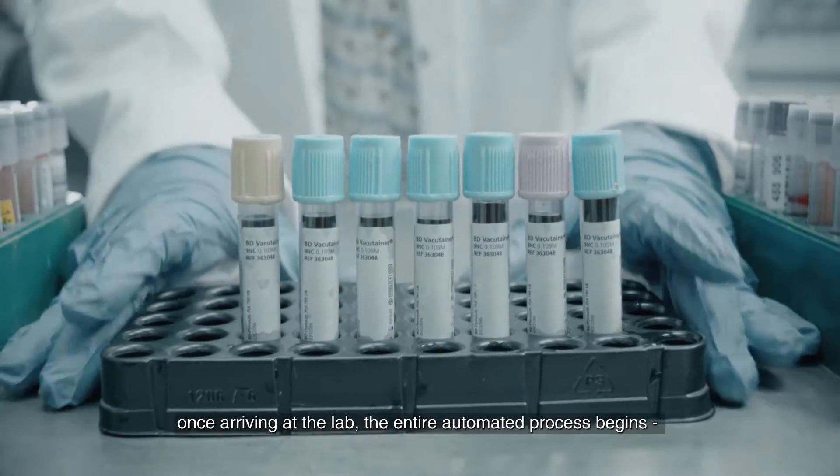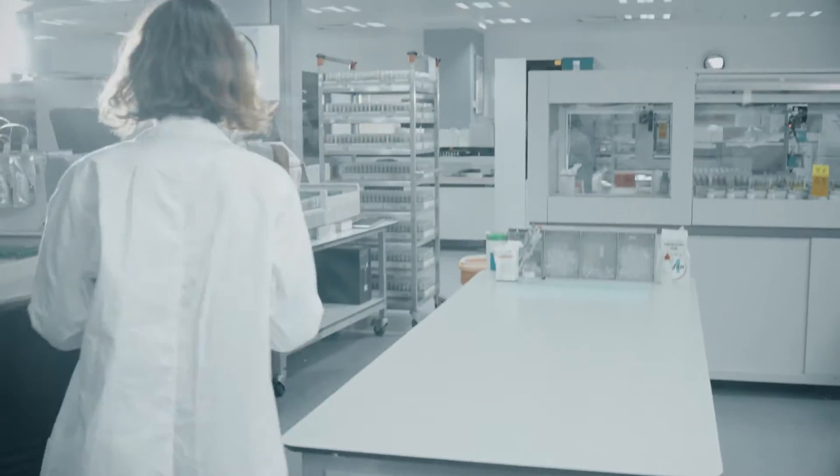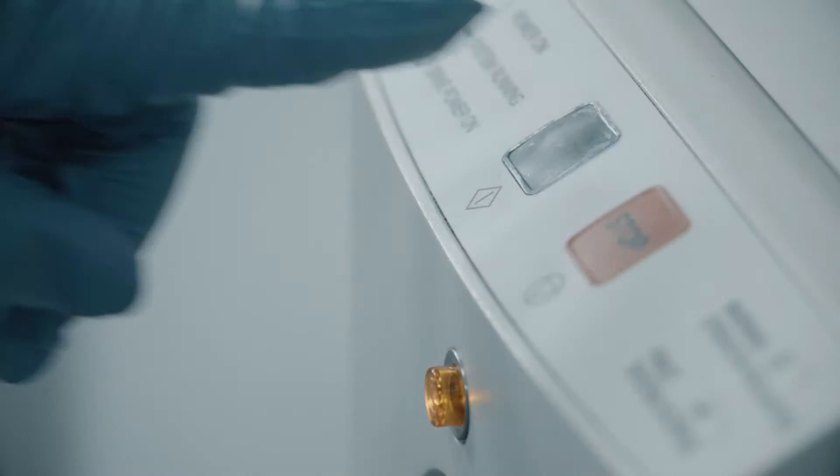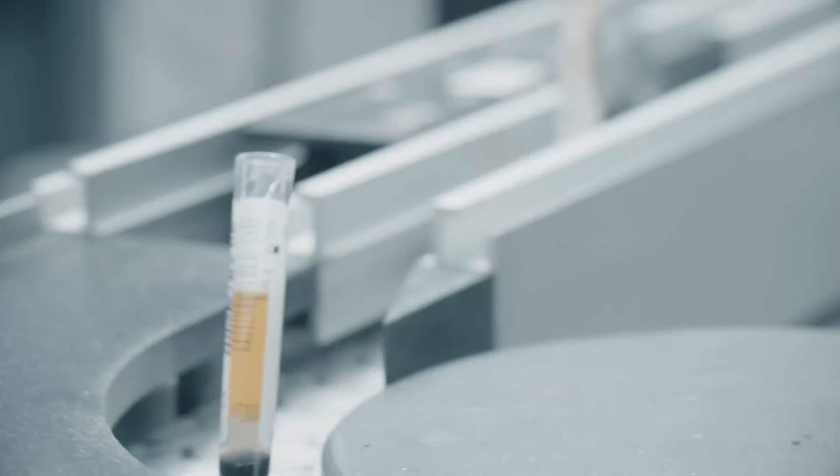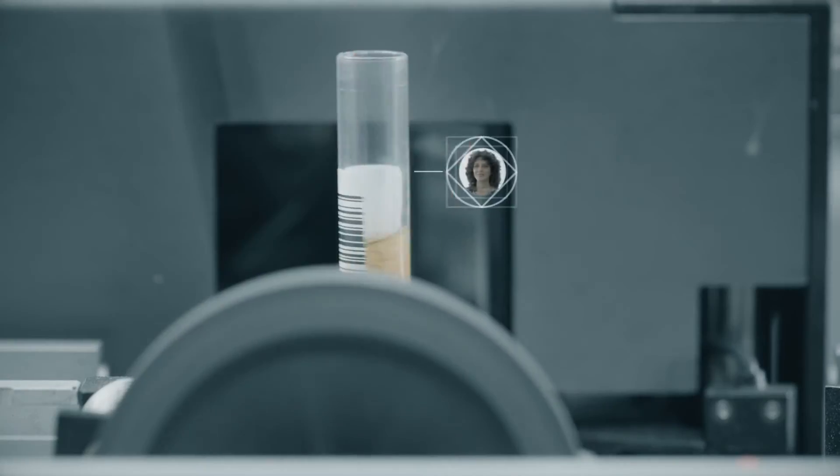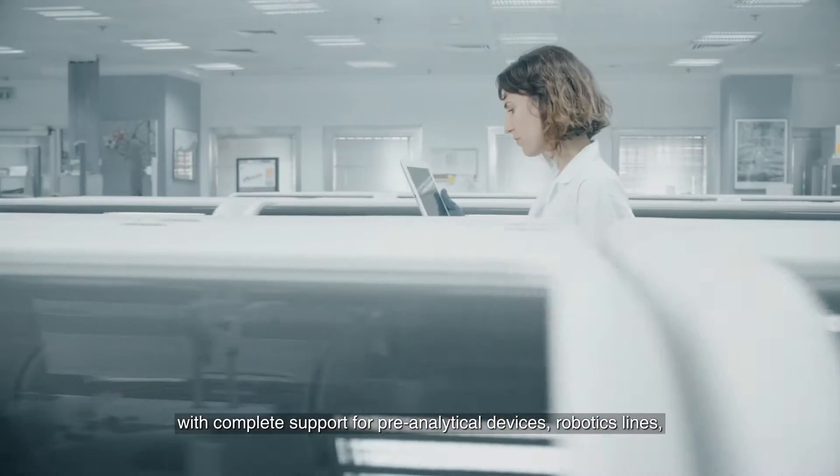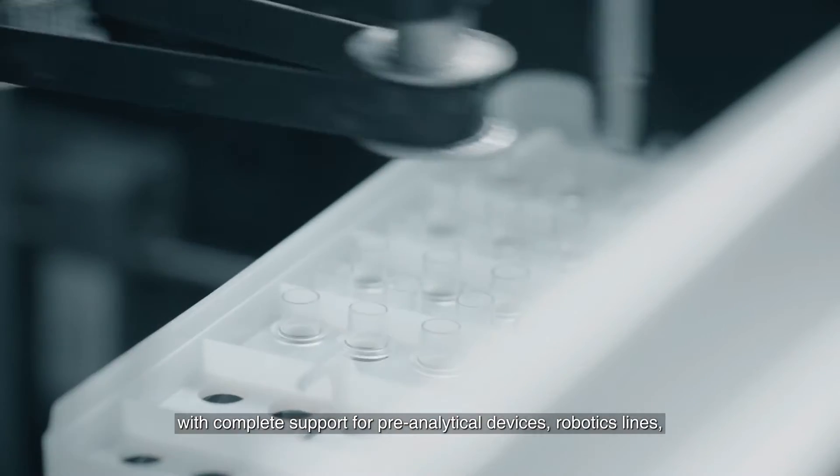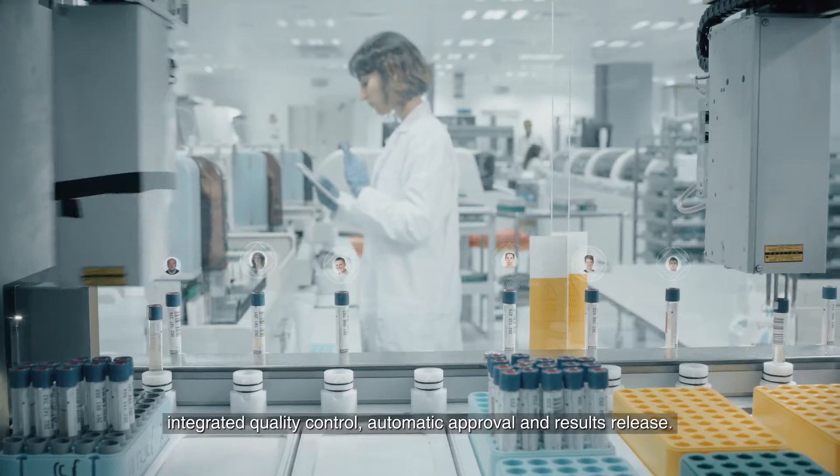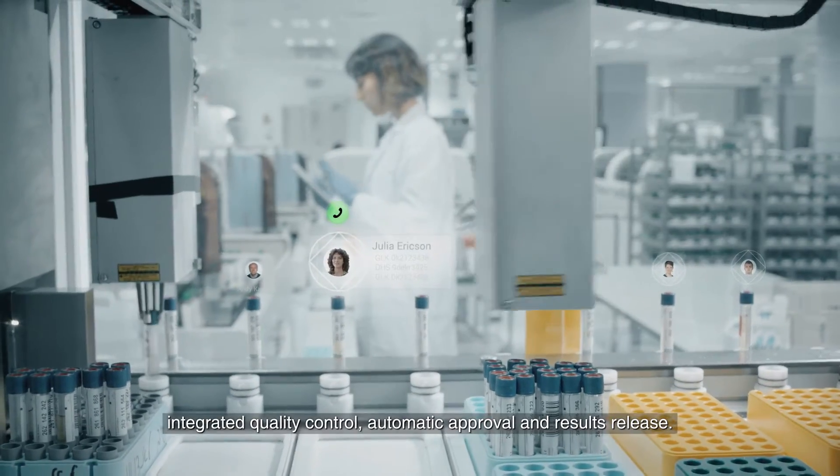Once arriving at the lab, the entire automated process begins, with complete support for pre-analytical devices, robotics lines, integrated quality control, automatic approval, and results release.